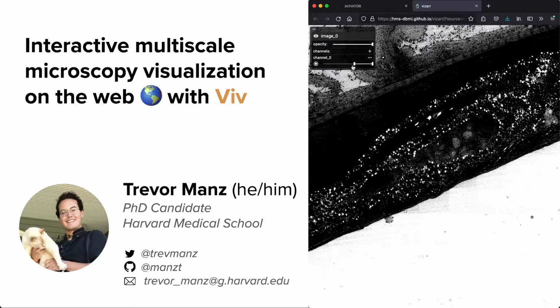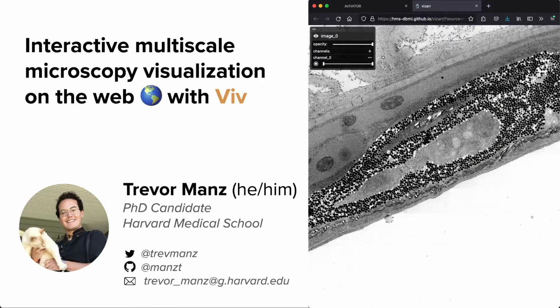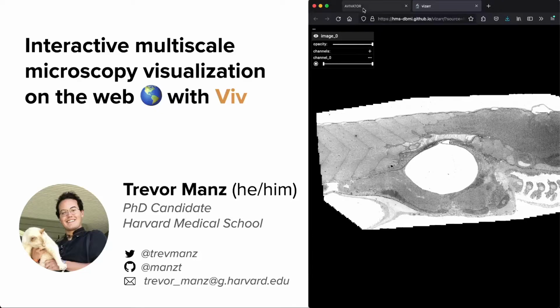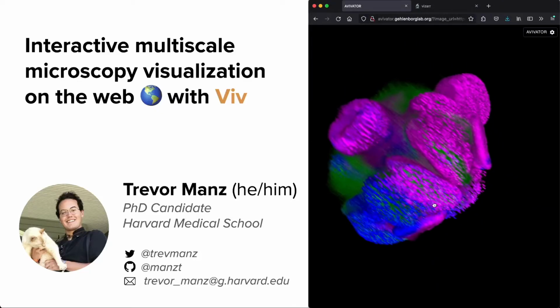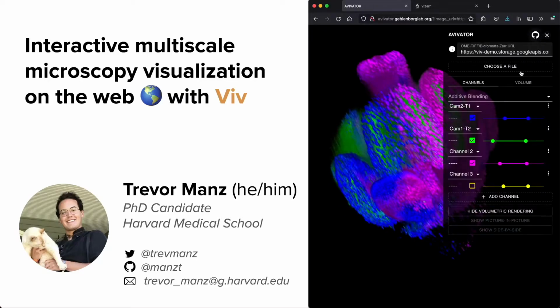I work in the Gehlenborg lab and develop interactive visualization tools for exploring spatial, omic, and microscopy data. Today, I'll be sharing Viv, a web-based tool for building interactive visualizations for primary high-resolution microscopy images.